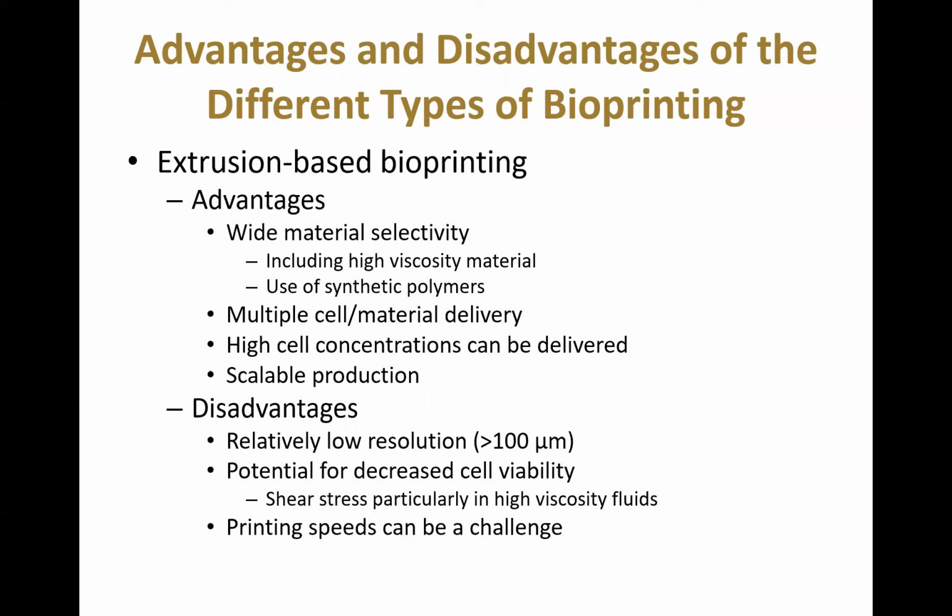Extrusion-based bioprinting, some of the advantages is wide material selectivity, different types of cells, high cell concentrations, scalable. Some of the disadvantages is low resolution and the production of shear stress, which can decrease your cell viability, and print speeds can be a challenge.